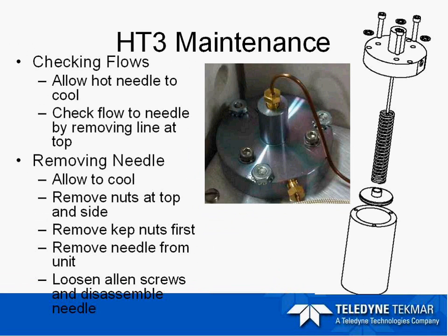Another issue discussed is the sample needle possibly being clogged with septa or blocked. When checking the flows, we want to make sure we cool the instrument down before removing any fittings so we don't snap them. To remove the HT3 needle, remove the lines at the top and the side, then remove the three hex nuts — this allows you to take the needle out of the unit before you disassemble it. After it has been removed, you can remove the three Allen screws to disassemble the needle from the spring and the housing. If you loosen the Allen screws first, the spring and other parts would fall down inside the unit.